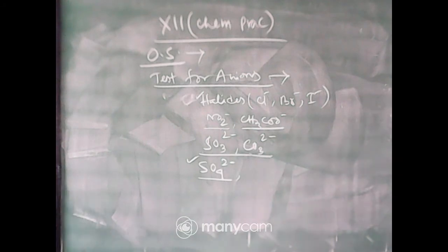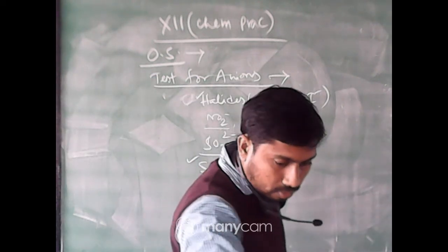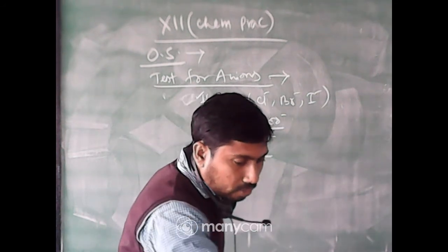Okay. So, for this I will reduce the volume of the solution so that it is easier. Now, dilute acid. Okay. Now, there is the dilute acid.